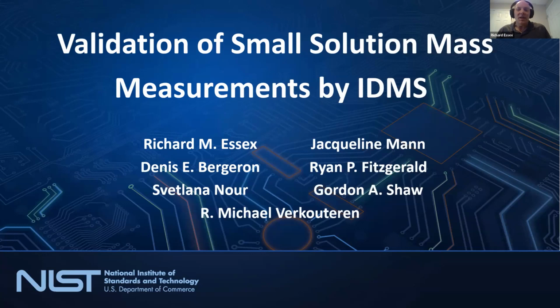We've been talking a lot about the potential for mass spectrometry as a powerful tool in radionuclide measurements. And in a strange sort of way, I'm going to be talking about radionuclide measurements, but use of mass spectrometry in a very different way, essentially using the capability of very excellent repeatability or precision to make a relatively precise validation of mass measurements, of a difficult mass measurement.